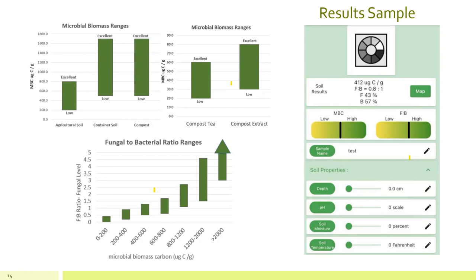As you know, paper chromatography, for those that don't know, is a way to evaluate many things in the soil. One of them is soil health in general. It shows you how the mineral profile is connected to the microbial profile, to this humification profile as well, and how these things are meshed. You can also look at contamination through this, so you can also evaluate it that way.